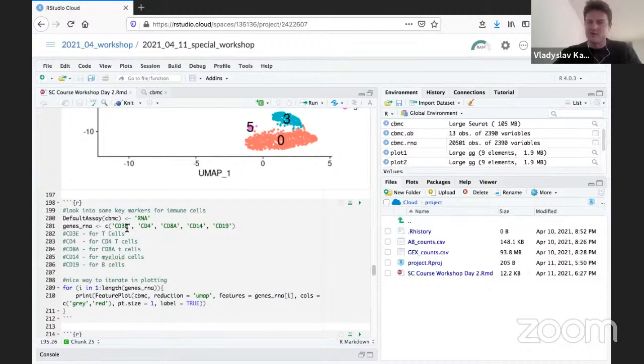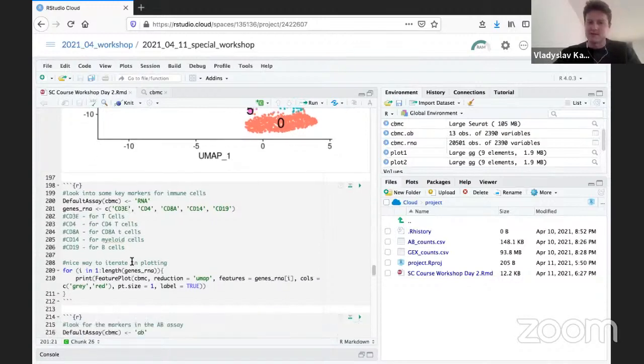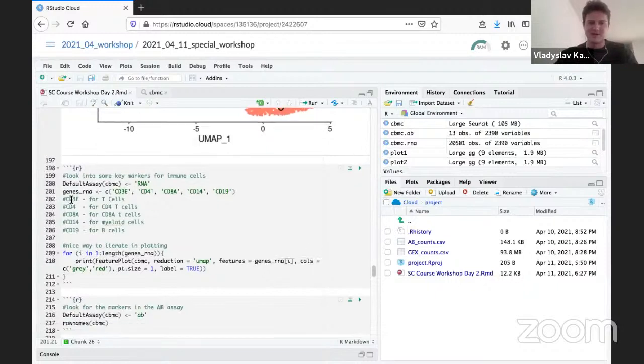And it helps a lot, before we do the find markers function, to take a look at some general markers that can describe some types of the cells. We are not doing the hardcore immunology today. We are not subtyping the diversity of CD8 positive T memory cells, like central memory, effector memory, and so on. We are doing really light immunology today, just to see what diversity you could have. So let's use only some markers here.